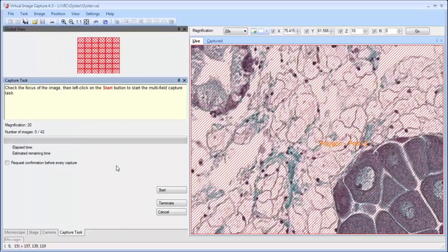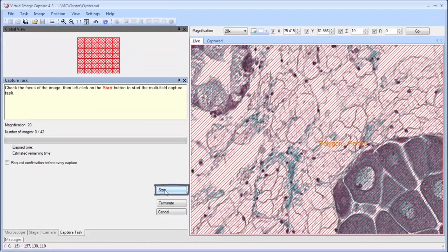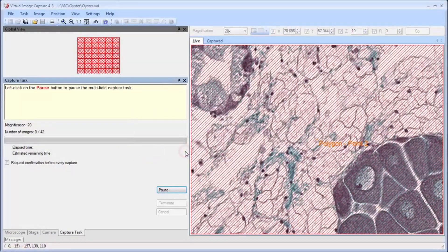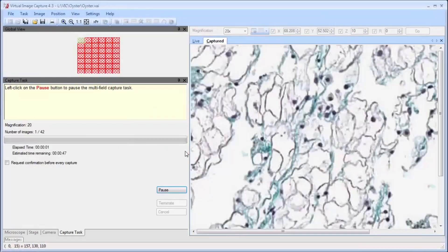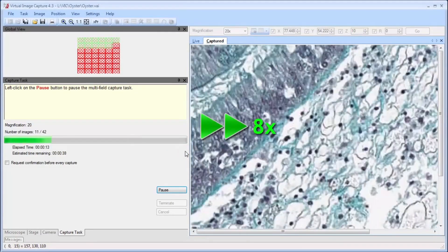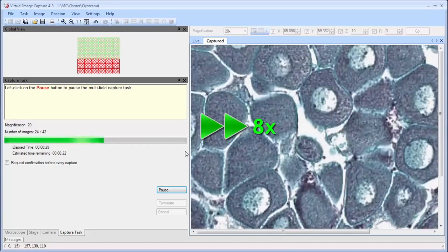An option lets the user manually adjust the focus in each field. Then click on start. The field that is captured is displayed in the capture window and saved in a file on disk. The fields captured are highlighted in the global view window.